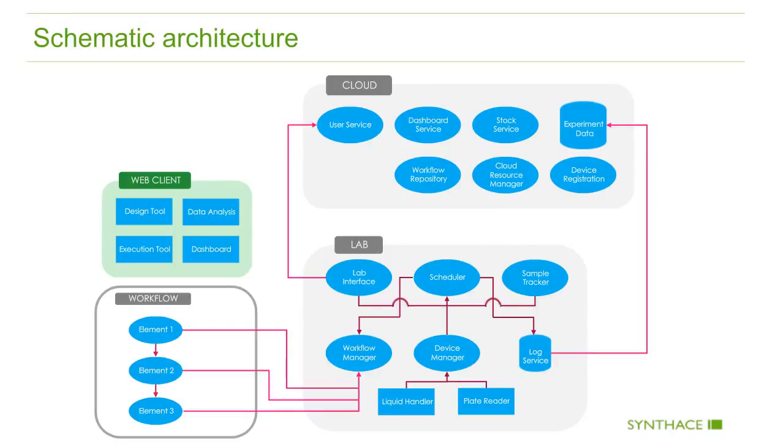At runtime, there is a connected group of laboratory equipment run by our lab manager. This includes a scheduler dealing with all the low-level details of when things move from one place to another. It also includes sample tracking and sample management, paying attention to all the objects that are in flight at this single unit, such as a Janus G3. The workflow manager is responsible for actually firing up all the standalone elements that make up any arbitrary workflow that you're trying to execute against this connected group of hardware. And it also is able to, if necessary, launch elements up in the cloud because these are wired up over the network and do not have to be co-located on the same machine.